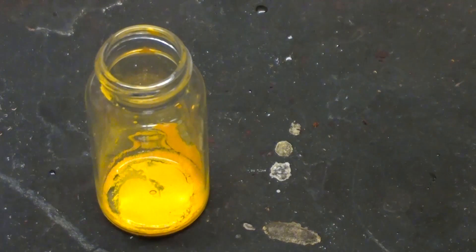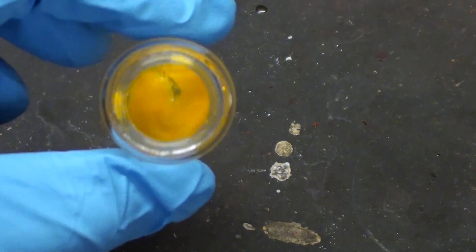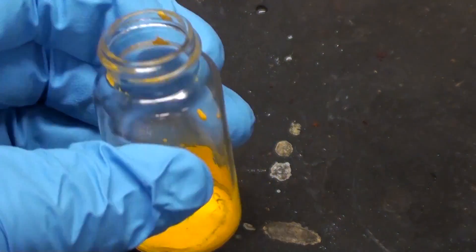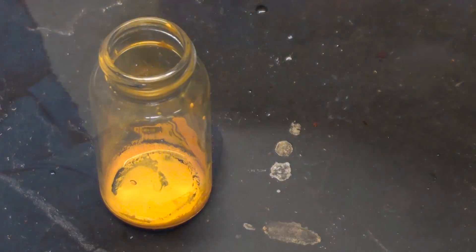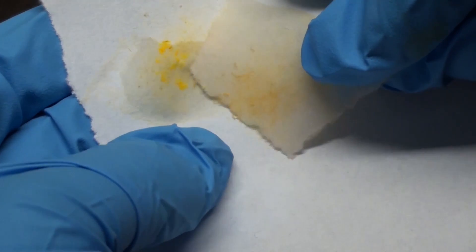Now before you go running off and testing everything for lead, I still recommend using a proper commercial lead testing kit. I'll show you why. This is a sample of lead based paint I was able to obtain. I'm certain it contains lead but when tested with our test paper there is no clear color change.